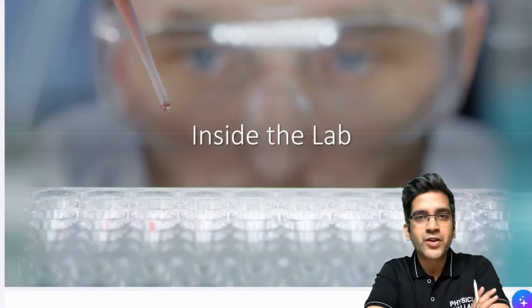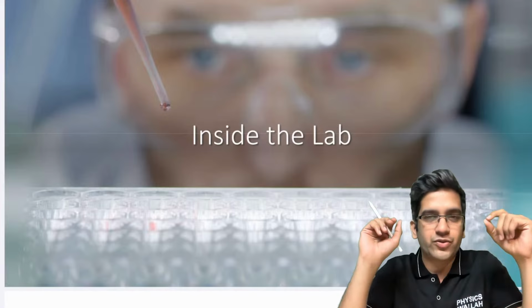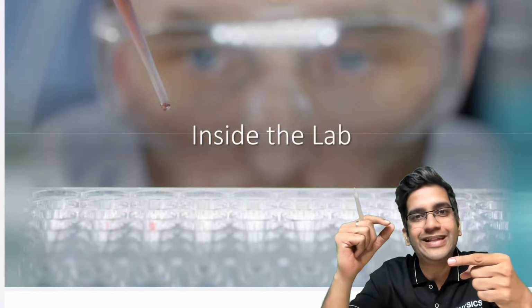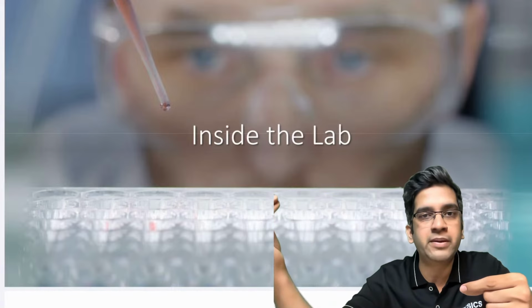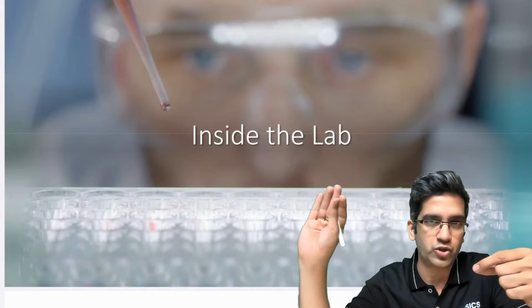Merry Christmas to you. So we did touch base about what a fixative is, right? Because what we saw in the previous class was that any tissue, if I take it from my body, will decay. For that, we use something called a fixative, like the same fixative you use in a dead body, the embalming fluid formaldehyde. That's the commonest fixative used for almost every histopathological tissue, right?